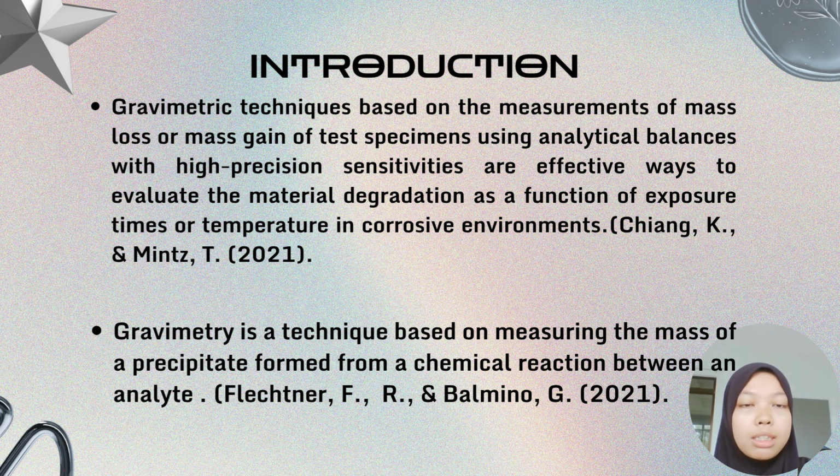Gravimetry also is a fundamental and versatile analytical technique centered on the precise measurement of mass changes, and it can be effectively utilized in two distinct ways. Gravimetry also is a technique based on measuring the mass of a precipitate formed from a chemical reaction with an analyte.